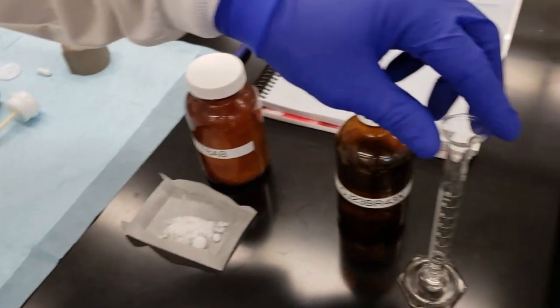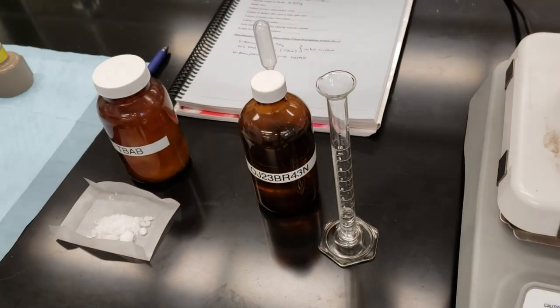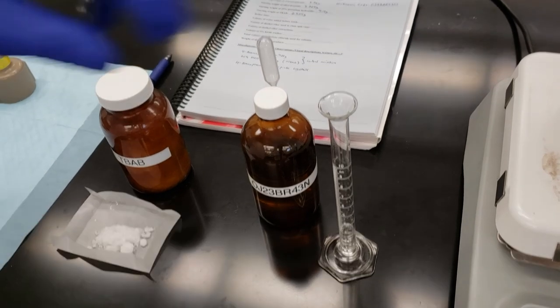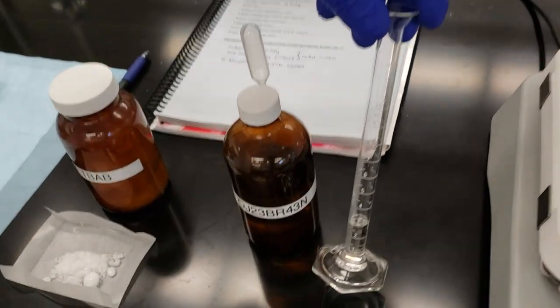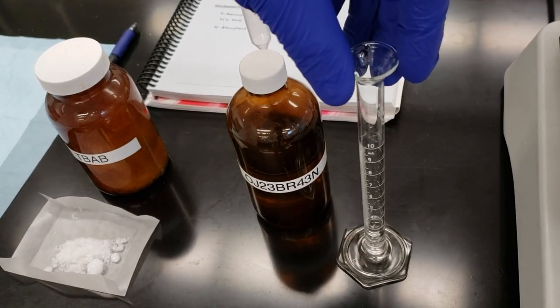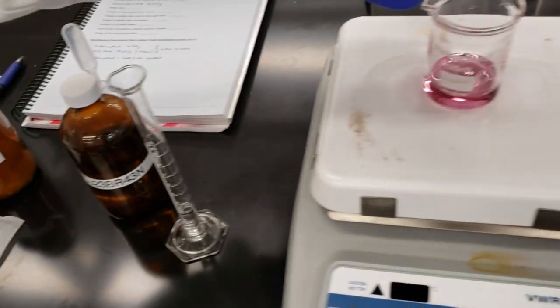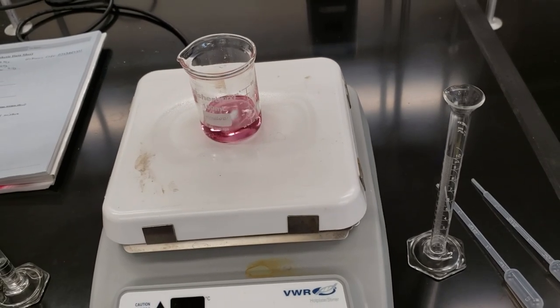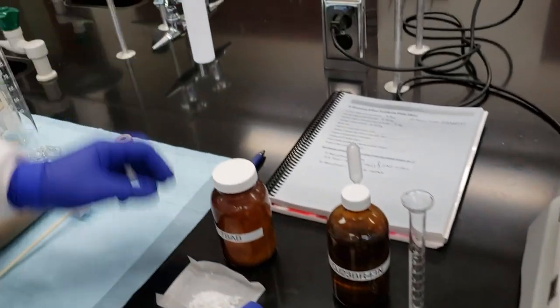We've also weighed out our unknown alkyl bromide. This is 3.024 grams. This is a liquid, of course, so we've got it in our graduated cylinder, so we'll add that into the vessel as well. And then we're going to take 8 milliliters of our 4-bromophenol solution in potassium hydroxide. So let's start adding these into our vessel.